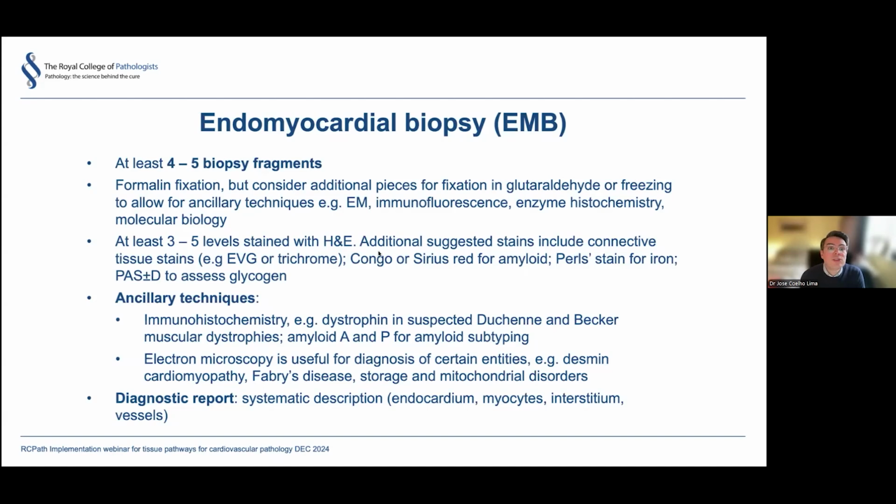So the first section of the guidelines dealt with endomyocardial biopsies or diagnostic endomyocardial biopsies. So we recommend at least 4 or 5 biopsy fragments to be taken or to be submitted.